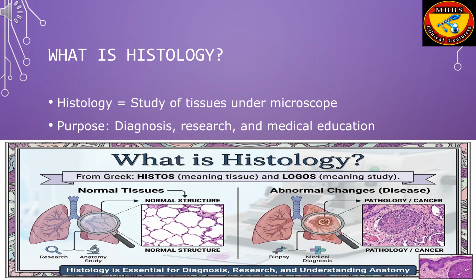Histological examination is commonly performed in hospitals and pathology laboratories. For example, when a biopsy is taken from a patient, the tissue is processed and examined microscopically to determine whether cancer or another disease is present. Histology is therefore essential for diagnosis, research, and understanding human anatomy.